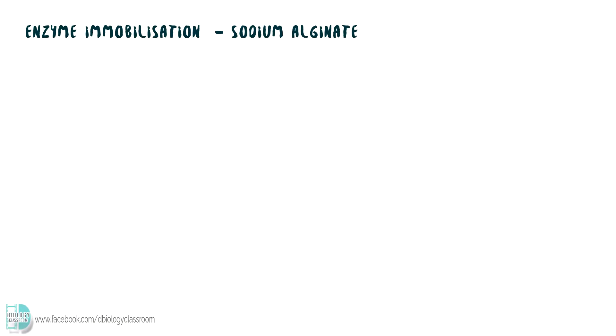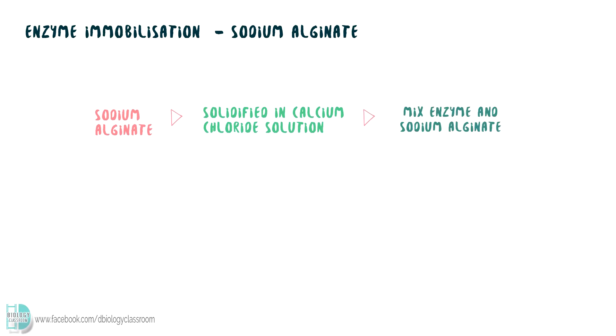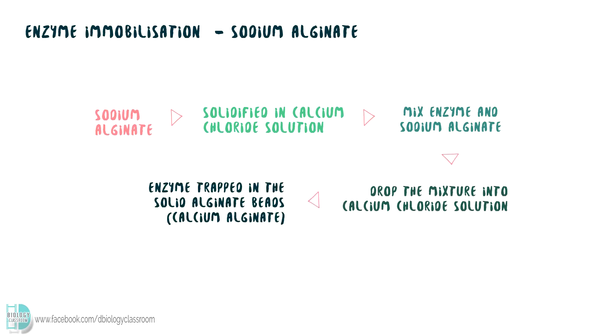One of the most common methods to immobilize enzyme is by using sodium alginate. It can be solidified in calcium chloride solution, so if we mix it with the enzyme molecules, then drop the mixture into calcium chloride solution, the enzyme will be trapped in the solid alginate bits.